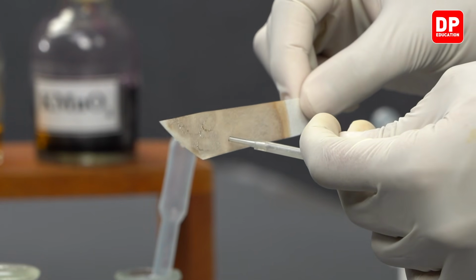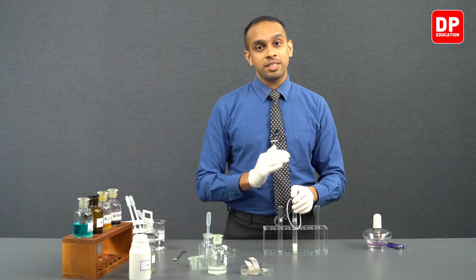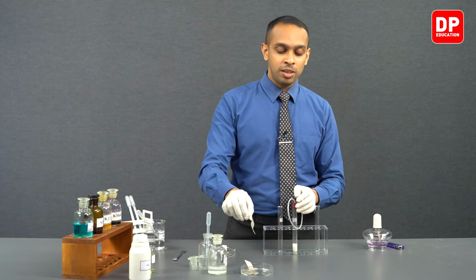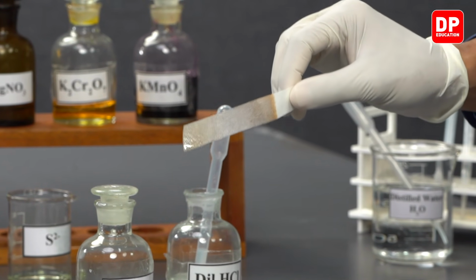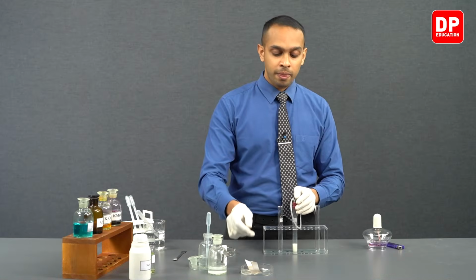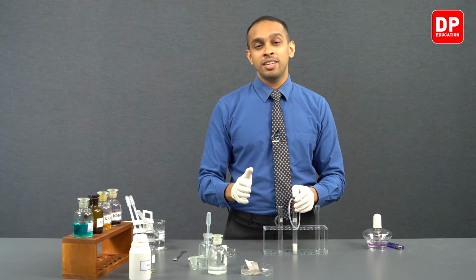Very clearly we can see when hydrogen sulfide comes into contact with lead acetate, it forms lead sulfide, which is going to be a black color precipitate, and that is why the filter papers soaked in lead acetate turn to a black color. So this color is observed due to the lead acetate turning into lead sulfide, which is a black color precipitate.